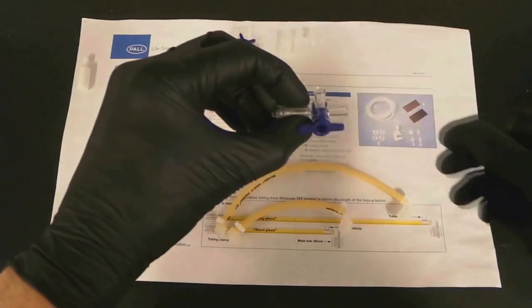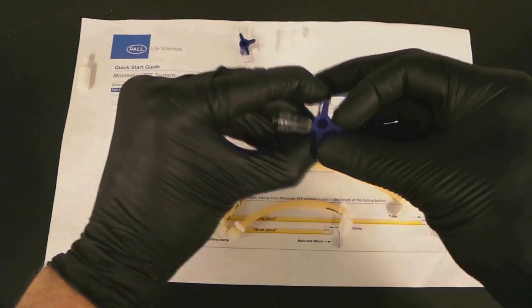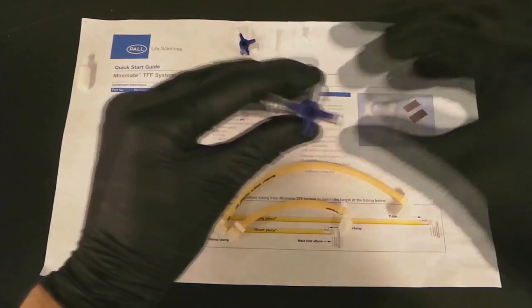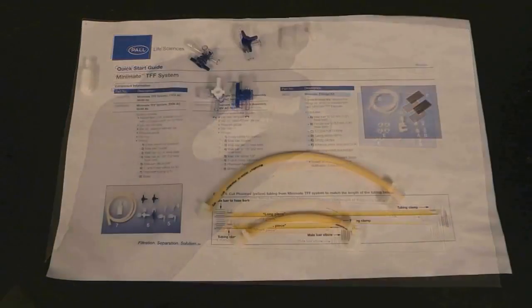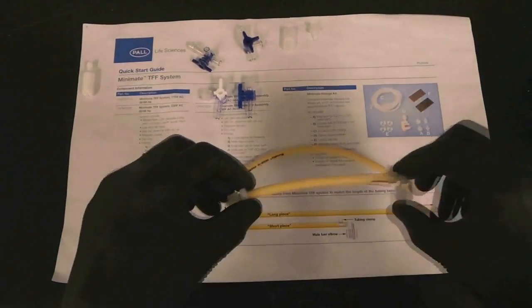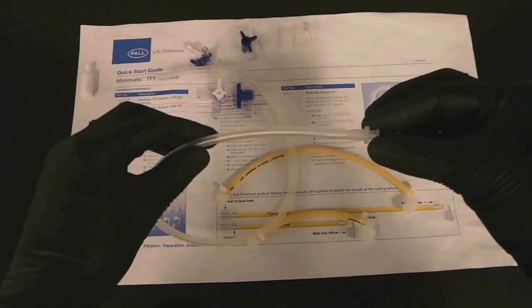Three-way adapter valves will be used initially on the reservoir and then with the LV Centramate holder, so get used to how the valve on top works to direct the flow properly. The long tubing will go from the reservoir through the pump head to the pressure gauge. The shorter tubing will go from the Minimate cassette back to the reservoir, and the clear piece of tubing will go to a vessel to collect the permeate.